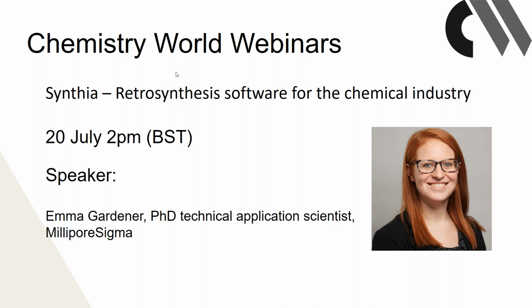We'll see how to save time and money by avoiding patent infringement. We'll look at alternative pathways to avoid hazardous or REACH-restricted chemistry, which can help protect your co-workers and the environment. We will look at how to generate new ideas and protect intellectual property by discovering previously unknown pathways and routes to the compounds you want to synthesize. And we'll look at what needs to be done to design pathways that lead back to commercial starting materials. We're doing all of that by looking at what Synthia can do for us.